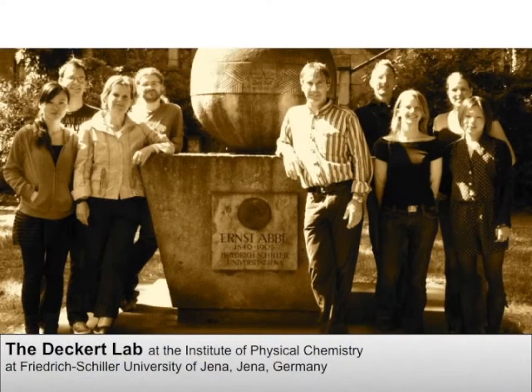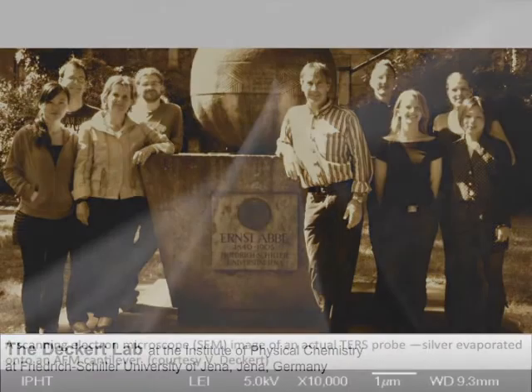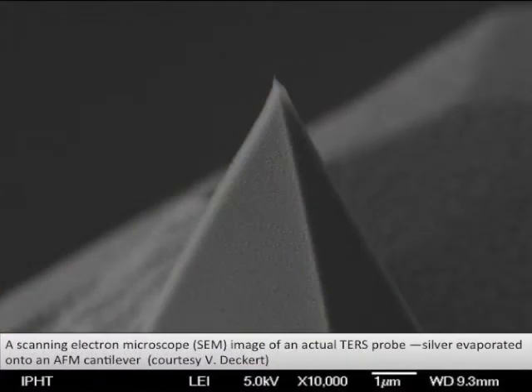Yes, sure. Tip-enhanced Raman spectroscopy makes use of electromagnetic field-enhancing capabilities of single metallic nanoparticles. In this respect, it is very similar to surface-enhanced Raman spectroscopy, or SERS. In contrast to SERS, where you use mostly many particles or agglomerates of many particles, here we use only one single particle. And this particle is then positioned by using an atomic force microscope with nanometer precision on a sample surface.